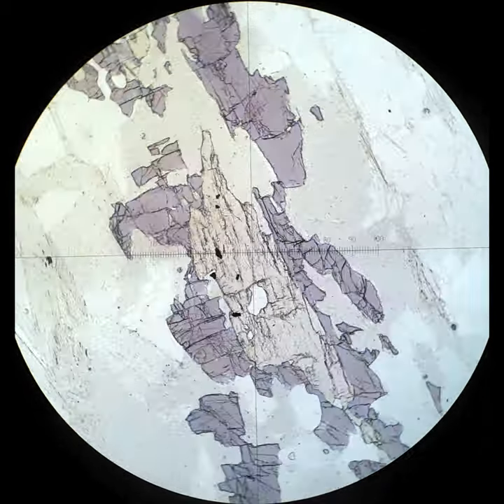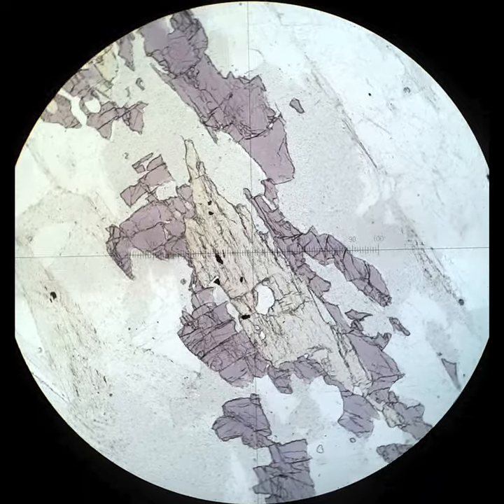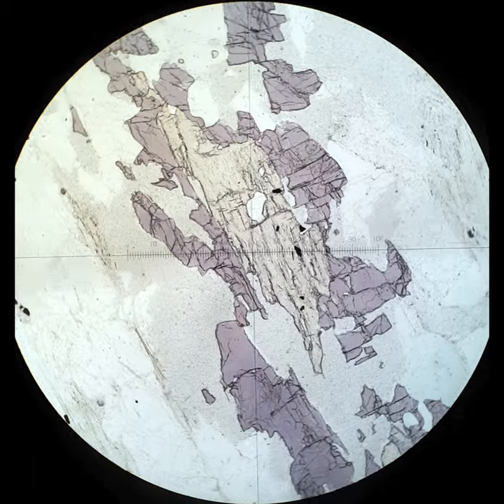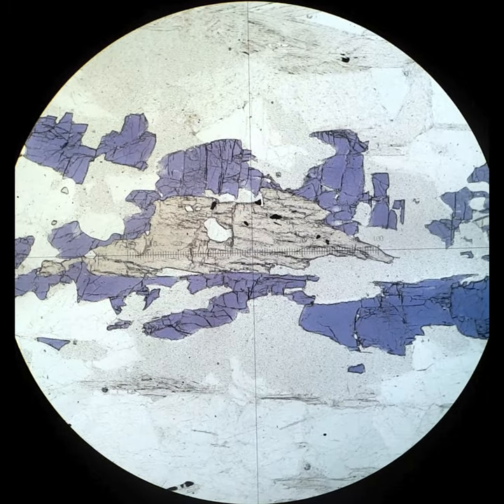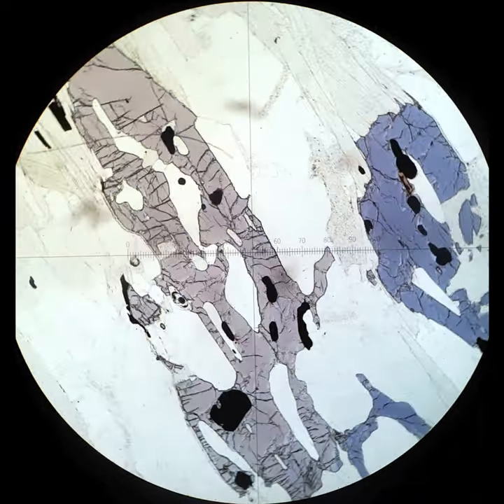The color that you see depends on how that light interacts with the lattice. In one orientation, the light might interact with the crystal in one way, and as you rotate the stage, it might interact with the crystal in a different way. This could give rise to different colors or different color intensities in different orientations, and this is what we call pleochroism.